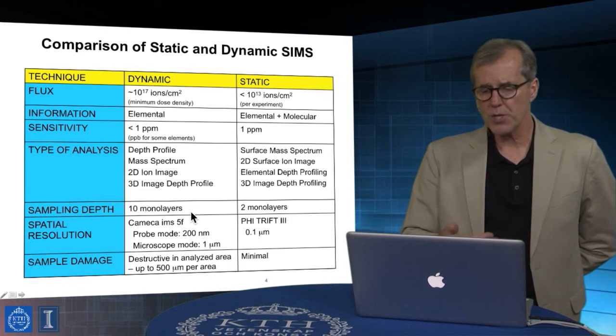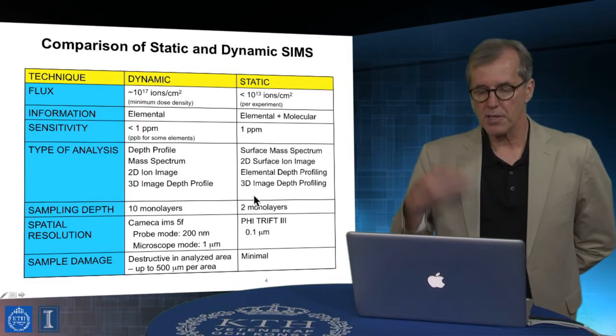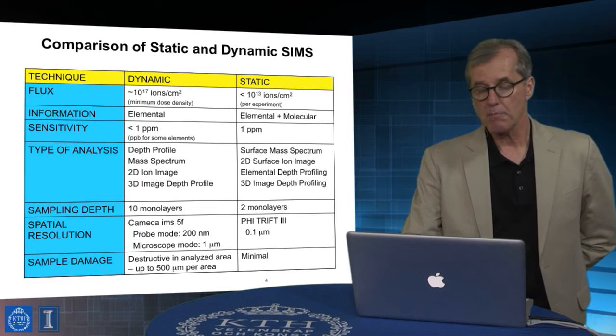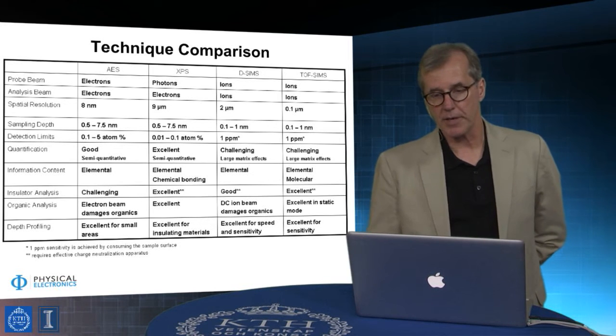And other words that you might hear, for example, people might use the word TOF SIMS. That just actually refers to the characteristics of the mass analyzer that's used, TOF standing for time of flight.